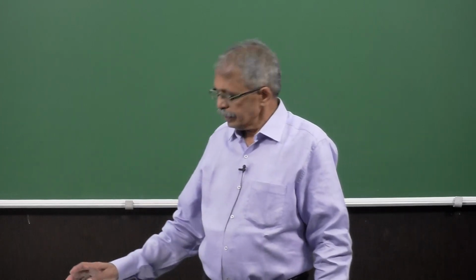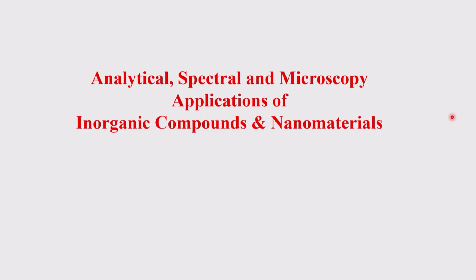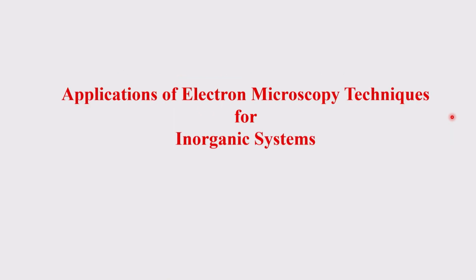So let us now, as the last topic of this course, look at the microscopy techniques. In the microscopy techniques, obviously we are going to look primarily at electron microscopy and things like that. We'll tell you in a while. And again, we will look at the applications towards inorganic compounds or nanosystems.